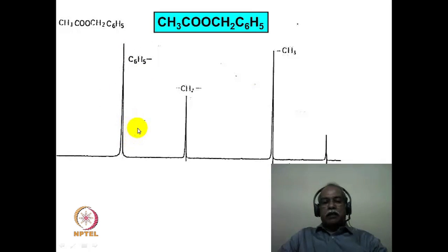Normally a phenyl derivative with an electron withdrawing or electron donating group, such as a nitro group or amino group, would appear as a multiplet in the region. Anytime in the aromatic region of about 7 to 7.5 ppm, a multiplet is observed with 5 hydrogen intensity, the inference is that it is a monosubstituted phenyl derivative.